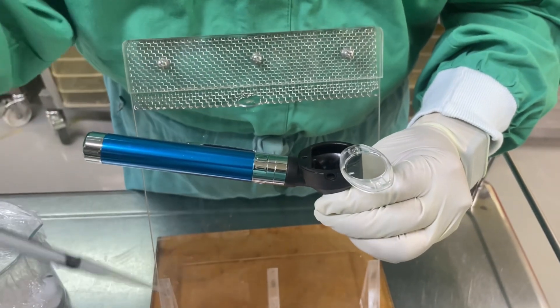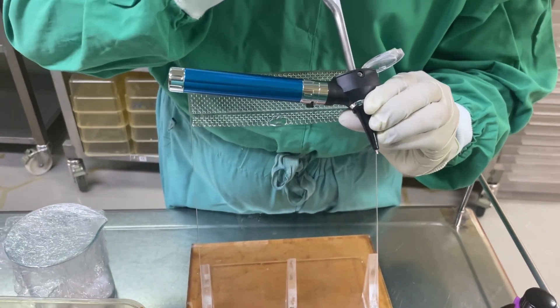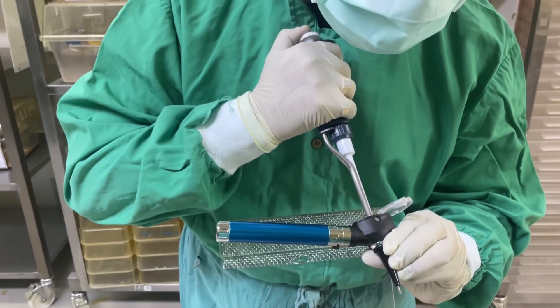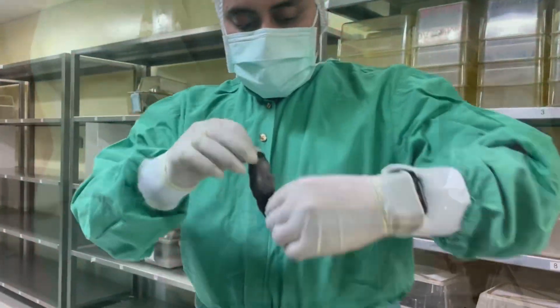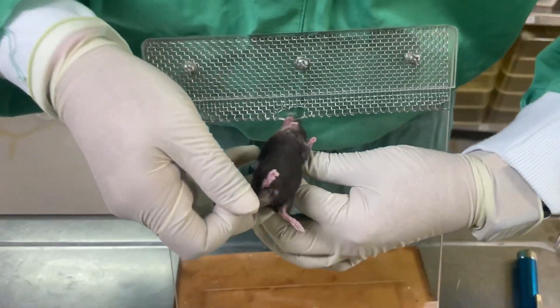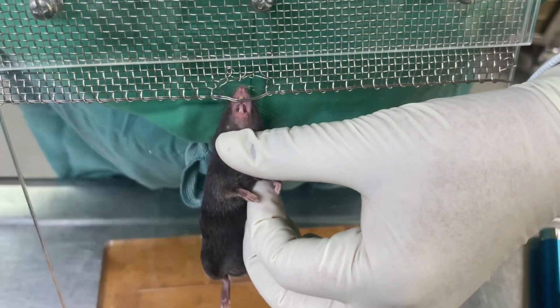Once you can see the trachea of the mouse, we will use a pipette — 200 microliter pipette — go inside slowly and then release the drug. This is how we will do the intratracheal treatment.